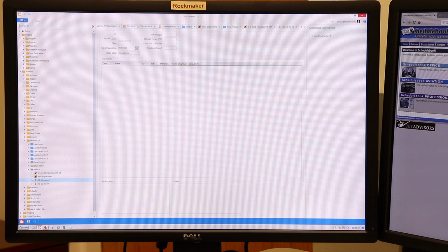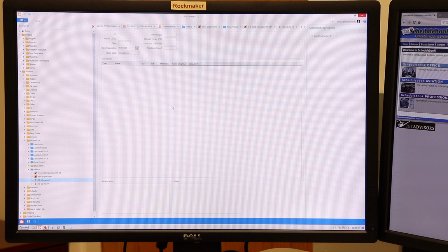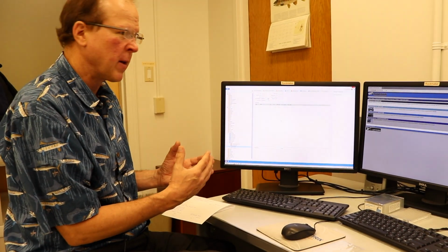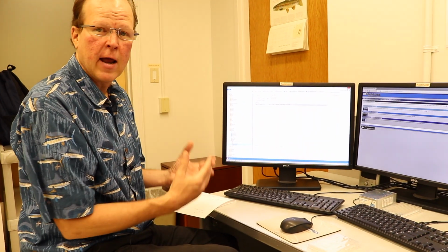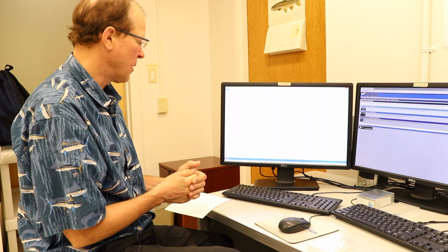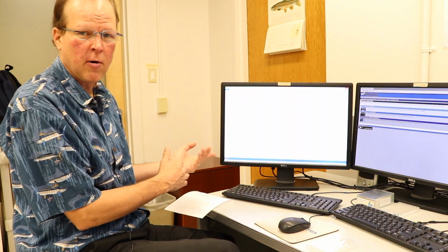And it gives you a tab for each protein so you can put in notes and things here. That being said, the software is designed so you can use it as your complete laboratory notebook in digital form and record all your information about the experiment within the software and have a permanent record of it rather than using a book. You can also use the book as long as you know your plate numbers and the names of your folders.